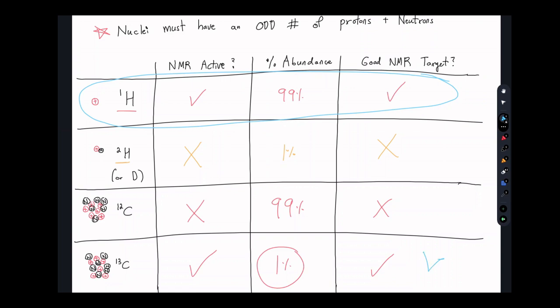Some universities may focus with their curriculum on carbon NMR, and that won't be covered here in this course. A lot of the principles are similar, but 1H NMR is more difficult and more informative. So basically, by understanding everything we can about the hydrogen in a molecule, we're able to elucidate its full structure.